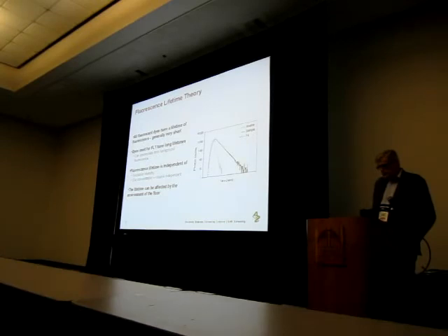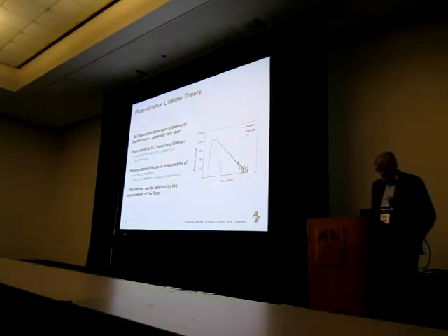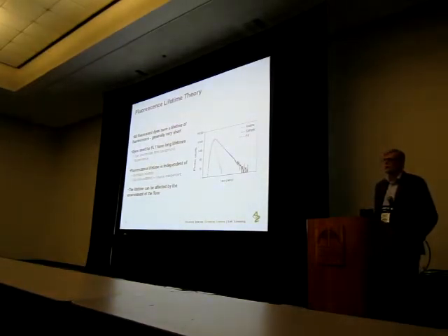So I'll not go into too much detail here because obviously Pierre knows a lot more about this than I do, and he's probably done a better job of presenting the fluorescence lifetime theory of it than I'm going to be able to do. But suffice to say that, of course, all fluorescence dyes have a lifetime, and what you really want is something with a longer lifetime. So GFP, for example, I think has a lifetime in the sort of 1, 2, 3 nanosecond range. And really what you're looking for is something with a lot longer lifetime if it's going to be discriminatory.